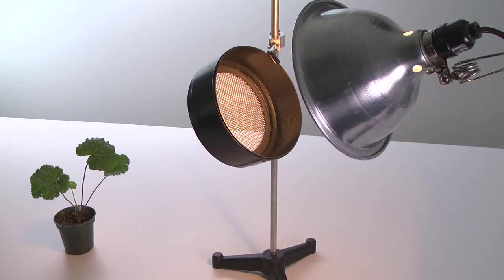One example of student-directed inquiry that can be facilitated with the inquiry toolbox is the study of plant growth under varying conditions of light intensity. Here, a single sieve is used to decrease the intensity of light received by the plant under the light source. Such a study might correlate with AP Biology Lab 1 or AP Biology Lab 10. The student would be required to plan and execute a study of the effects of light intensity on plants and potentially animals.